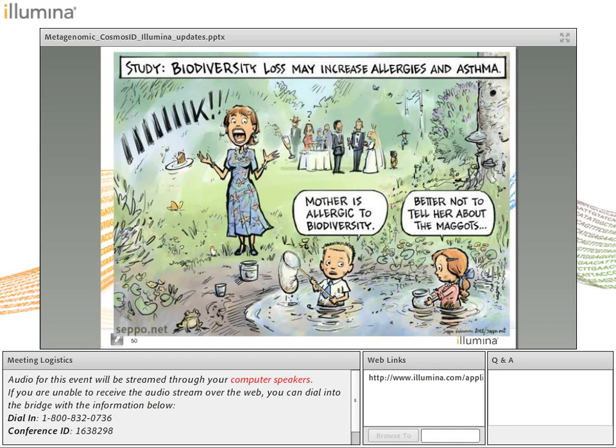But then afterwards, do you think, Purani, that coverage makes a huge difference in your software also? Yes, we usually recommend around 10 million reads minimum to get a good result. And you also have to be careful about the amount of host background that you have. If it's, say, a human clinical sample, and the host background DNA is very dominant in the sample, like 95% or something, then you may want to do some host DNA reduction so that you get better resolution of the microbial content in the sample. One more thing I didn't say: it also depends on how complex your sample is and on the diversity of the sample itself.